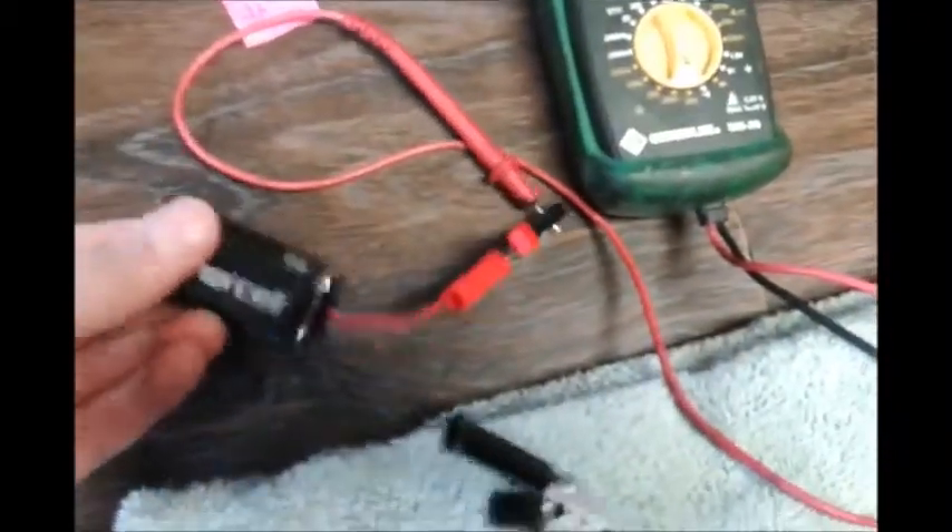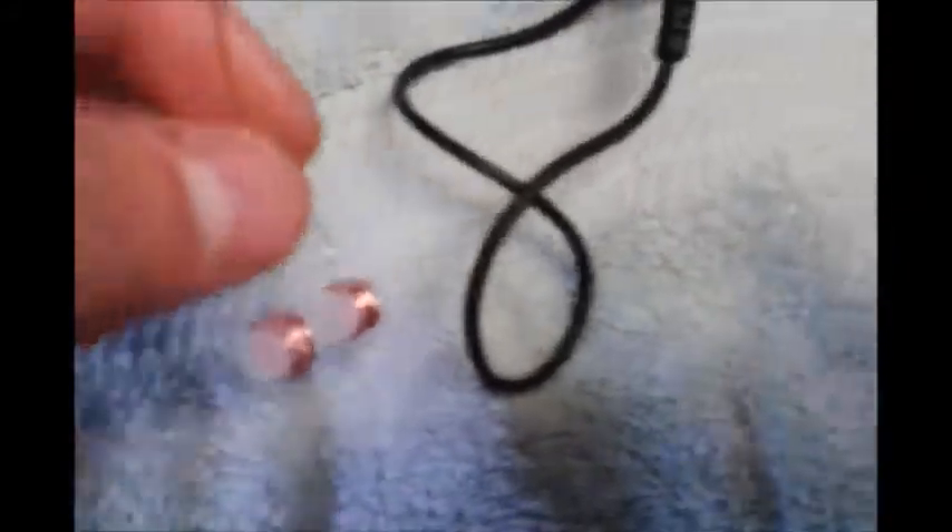The multimeter we'll be using to test the conductance. The battery goes into the sensor, which gets dipped into the water. As you can see, it's an open circuit, and the electrolytes will be closing the circuit.